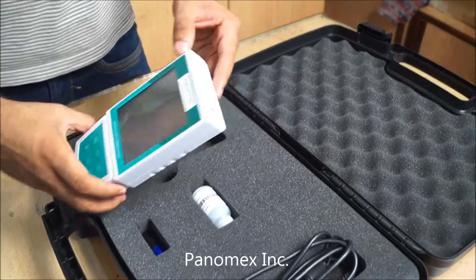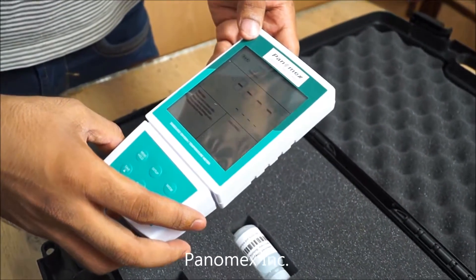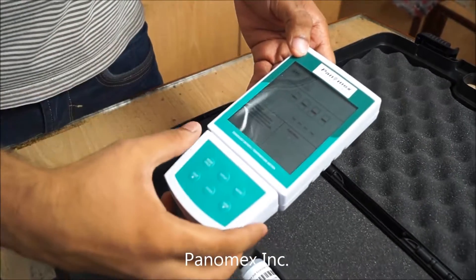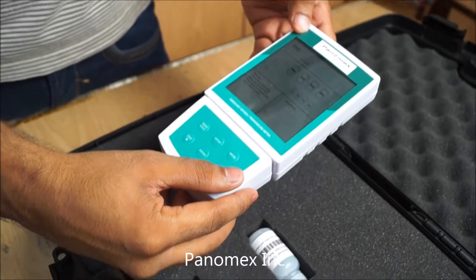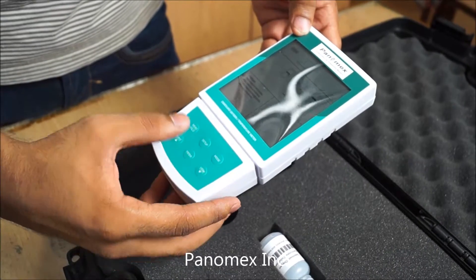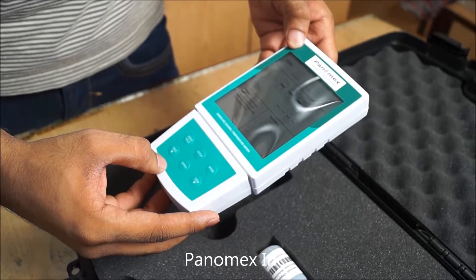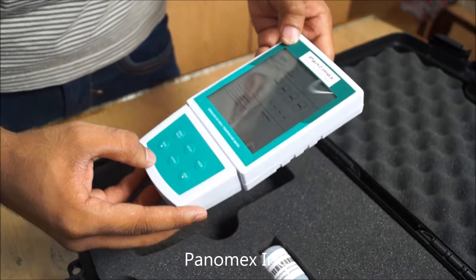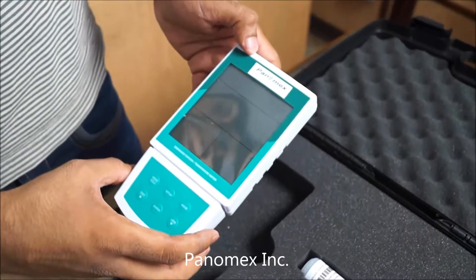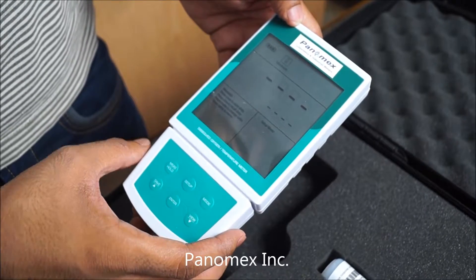I will switch on the DO meter from here. Our instrument is ready to use. This DO meter has an easy-to-use keypad. I am demonstrating how to set up date and time, which is a prime requisite if you want to store data for analysis.